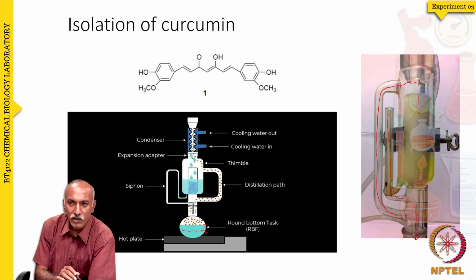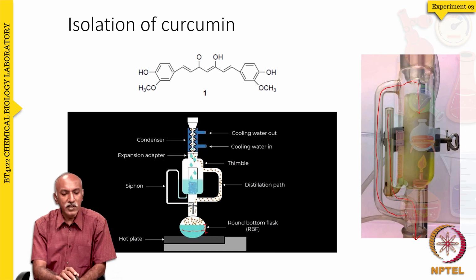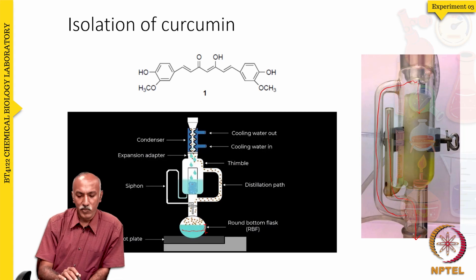So that you will get a better extraction of the compound with a low amount of solvent. That is the reason we are using the Soxhlet apparatus.